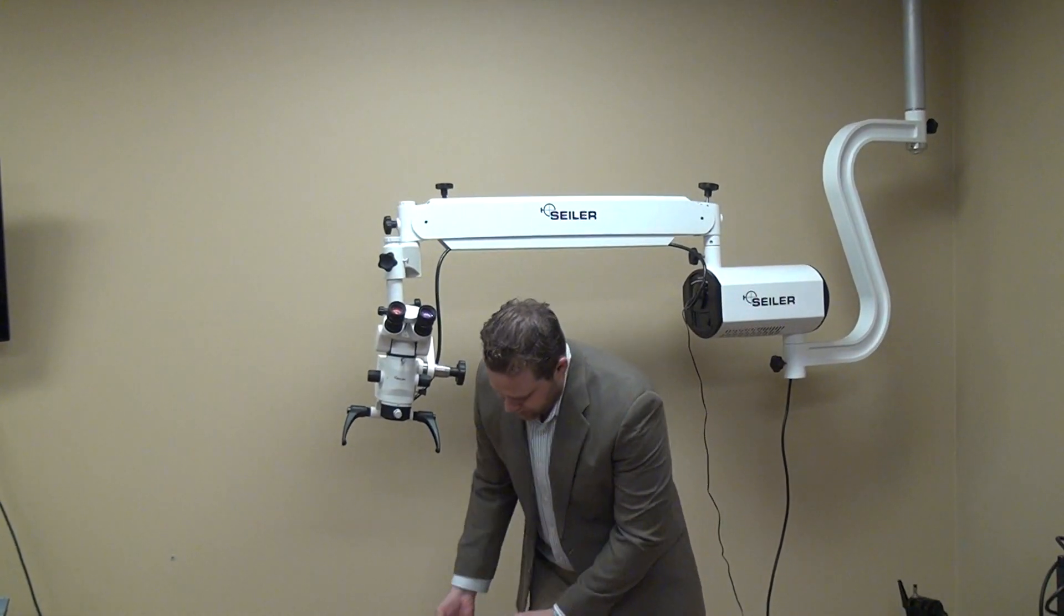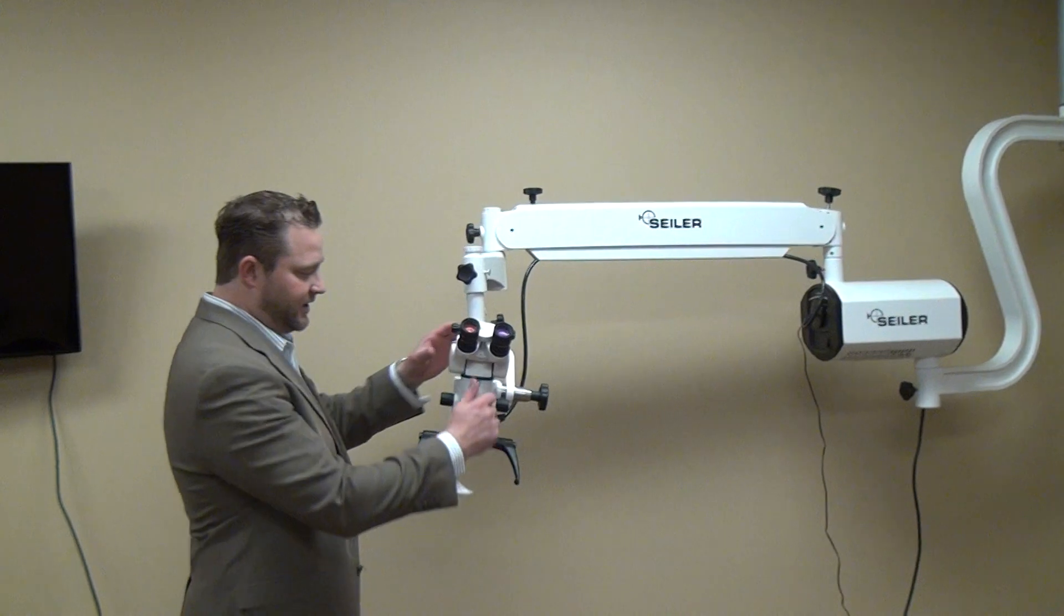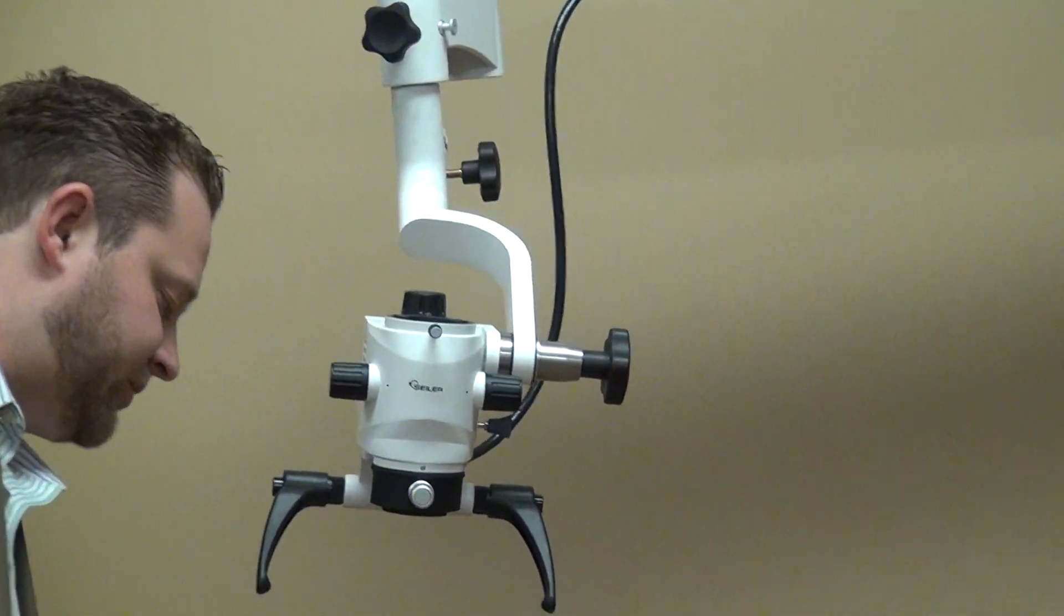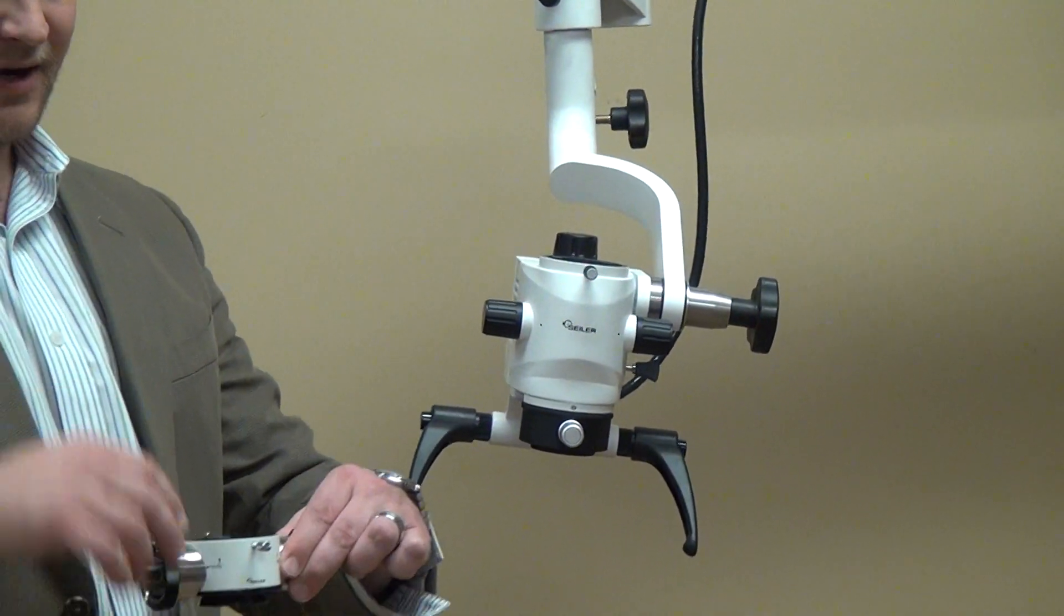First, you put on the beam splitter, which we have a 50-50-2080 beam splitter. So 50% of the light is going to go out the port when you're looking through the microscope.